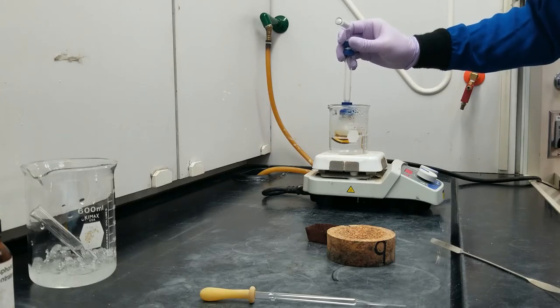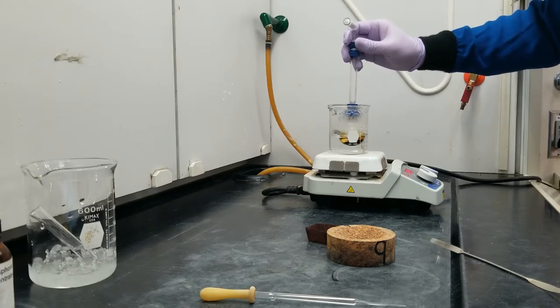What we're doing today is only running for 3 minutes, and if I was trying to do this to completion, if I was trying to make a ton of acetyl ferrocene, I would actually change up the reactant amounts and I would run this a lot longer.